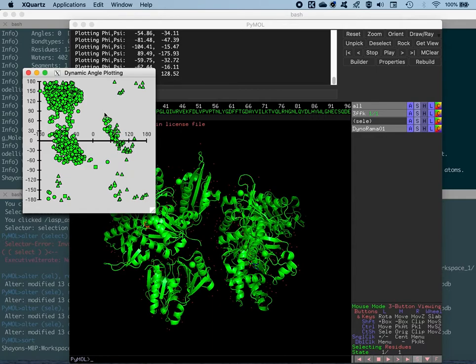And then you find a few outliers of the common amino acid residues apart from glycine and proline around here, as well as with the round symbols here, and also a proline residue that belongs to this region. Again, here's the thing with the proline residue.